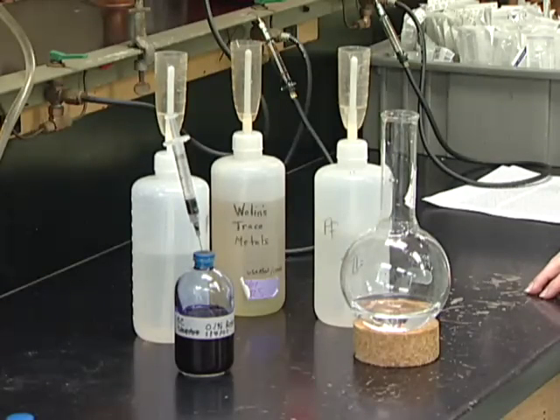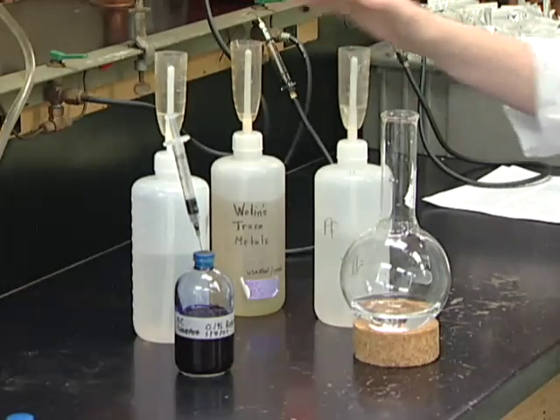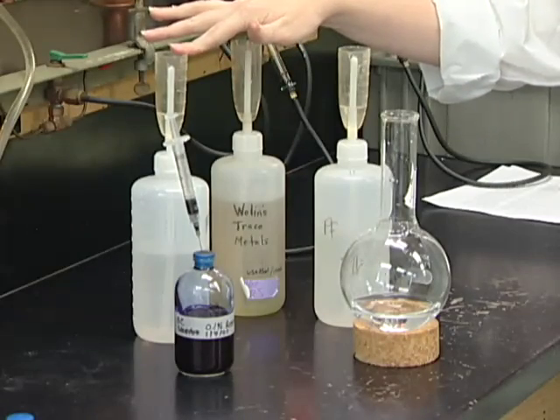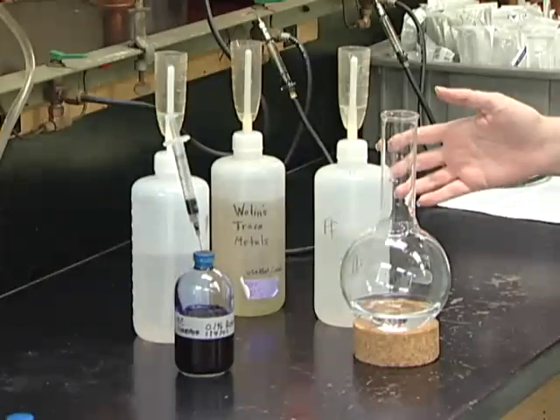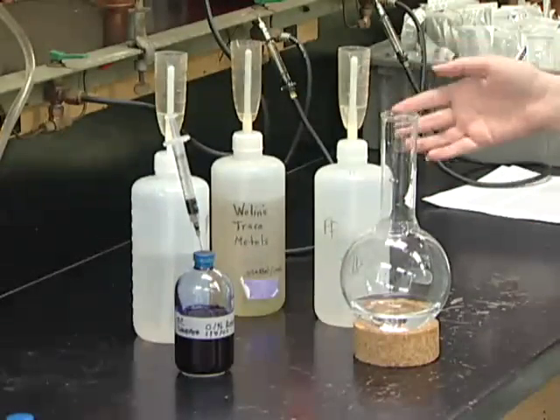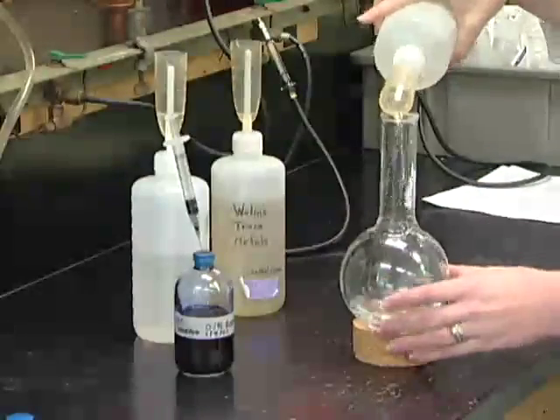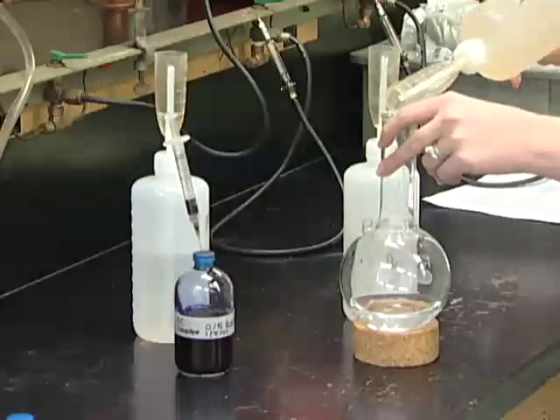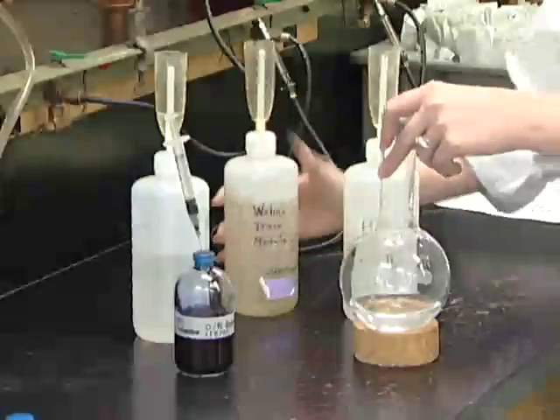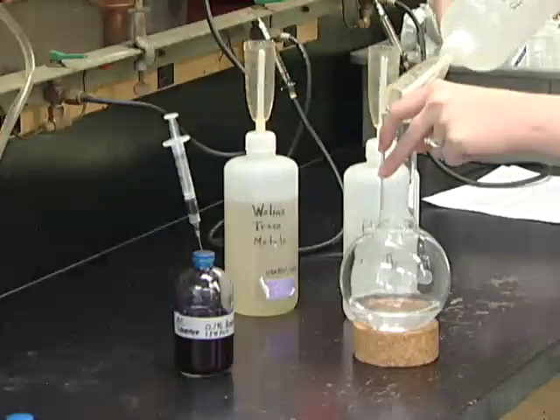Making anaerobic media is very similar to making aerobic media when you're first starting out. We're going to have minerals, metals, and vitamins that we're going to add in. In our lab, we like to keep larger stock solutions of these so that our media can be consistent from one experiment to the next. I'm going to add these into our water, and I have 10% more water in there than the recipe calls for so that we'll have extra whenever we boil.